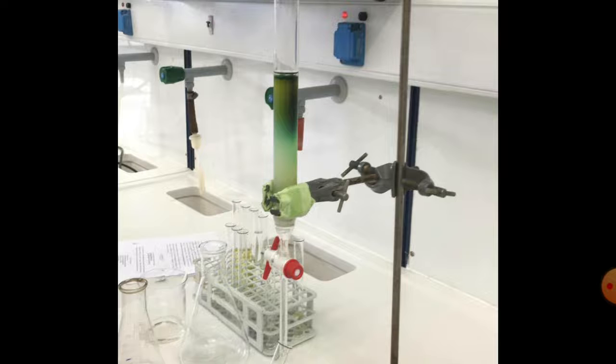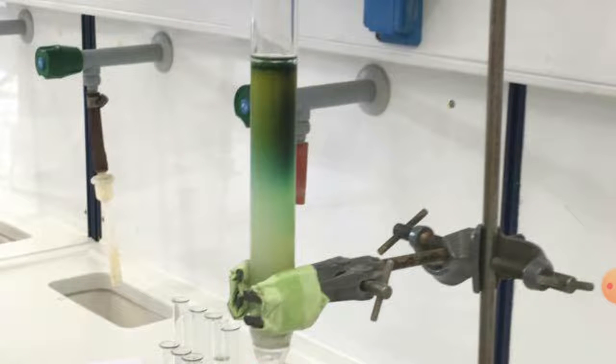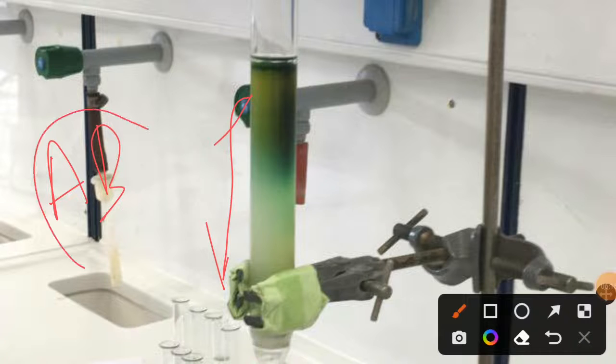due to dry packing, it can lead to cracking in the adsorbent layer. Adsorbent layer means our solid phase, okay. So air bubbles can be entrapped between the solid phase and mobile phase due to dry packing, that facilitates cracking in the adsorbent layer. That is the major disadvantage of column chromatography, okay.